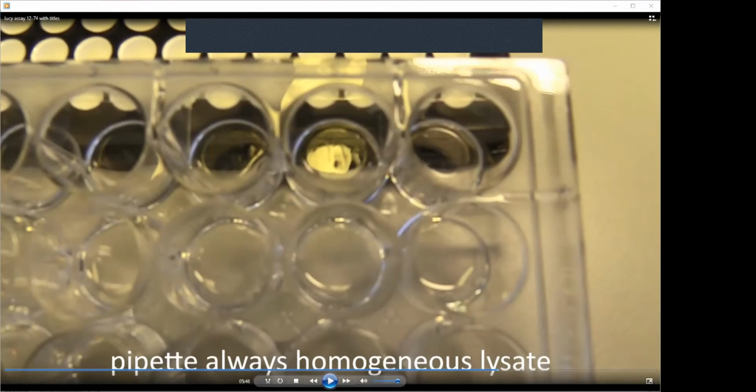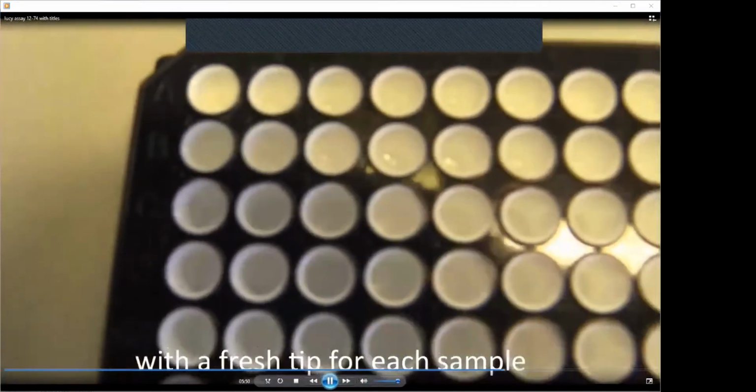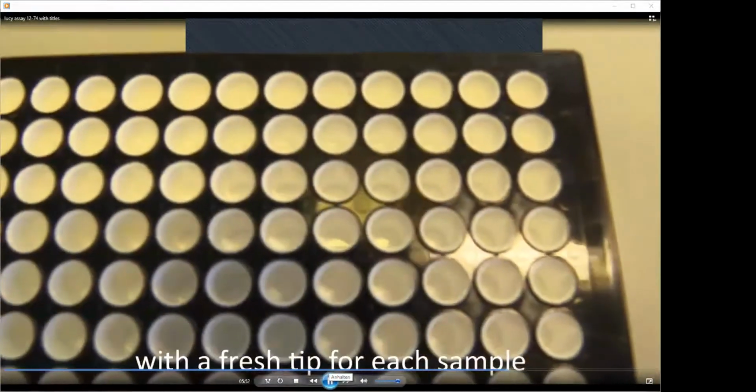So either you decide to use only the liquid part, or you also pipette it as long as the cells are homogenized and you always have the identical type of lysate.